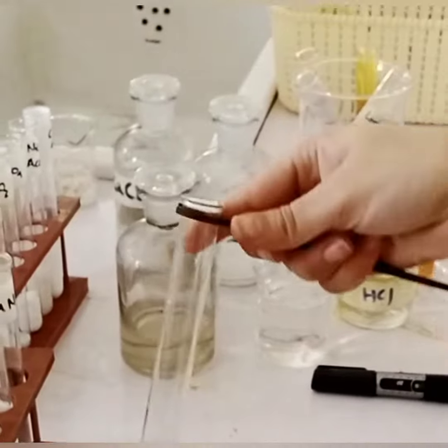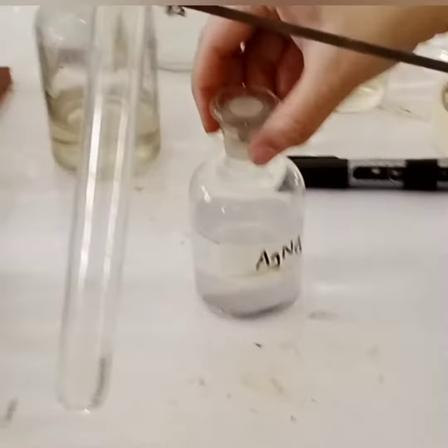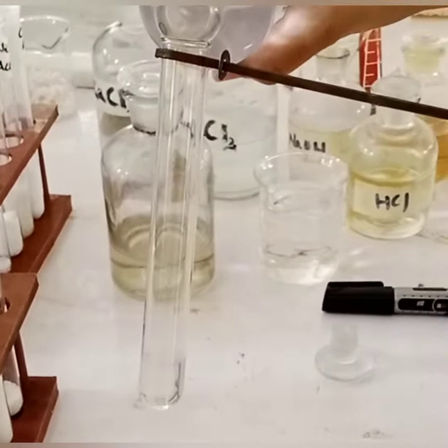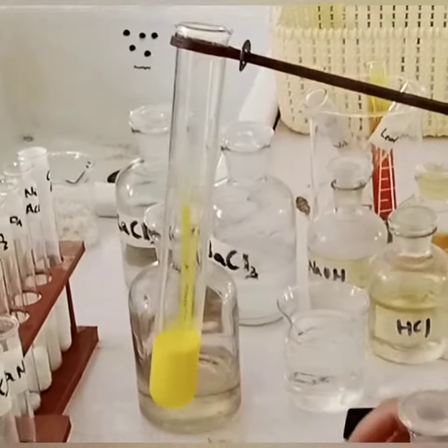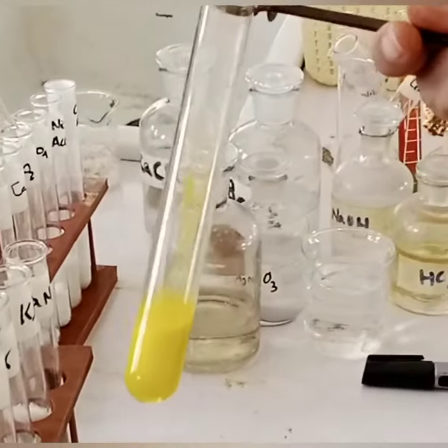After making the original solution, you have to add silver nitrate in the test tube, and you can see that as soon as I added silver nitrate, yellow precipitates are formed in the test tube. So this is a very important and easy test to identify the iodide radical.